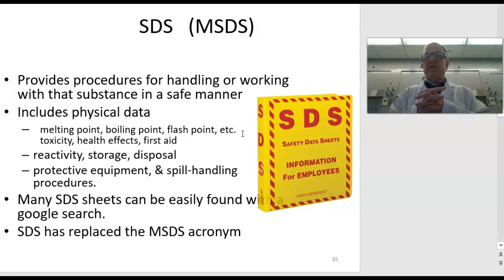They're important things for you to know about as a chemist, and to put to use as you go into the lab. If you're doing your pre-lab study beforehand, and you see a chemical that's labeled as hazardous, go ahead and read about it. It's probably a good idea to read about all the chemicals that you're going to be using in lab before you ever get there, so you'll know how to safely use them.